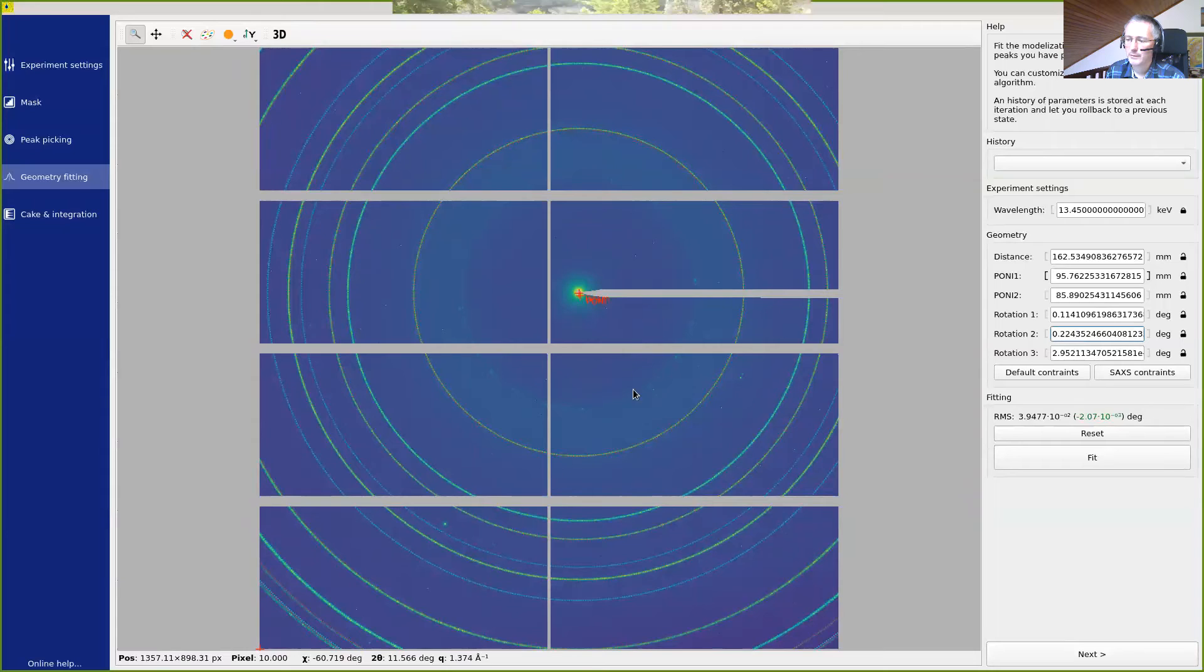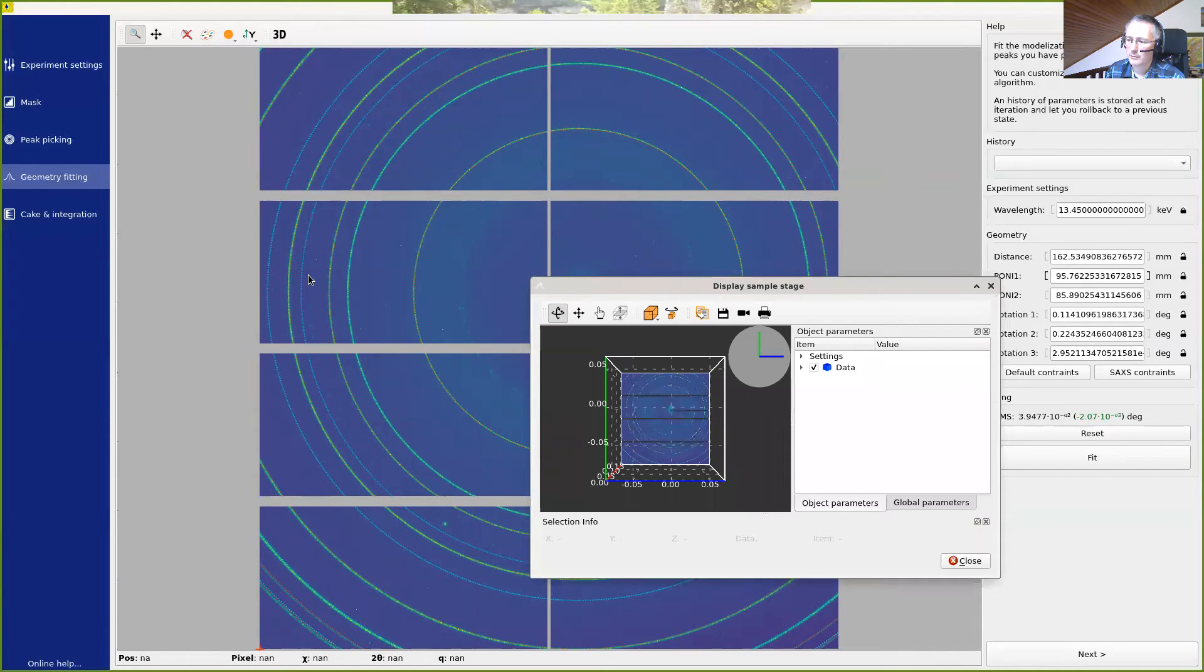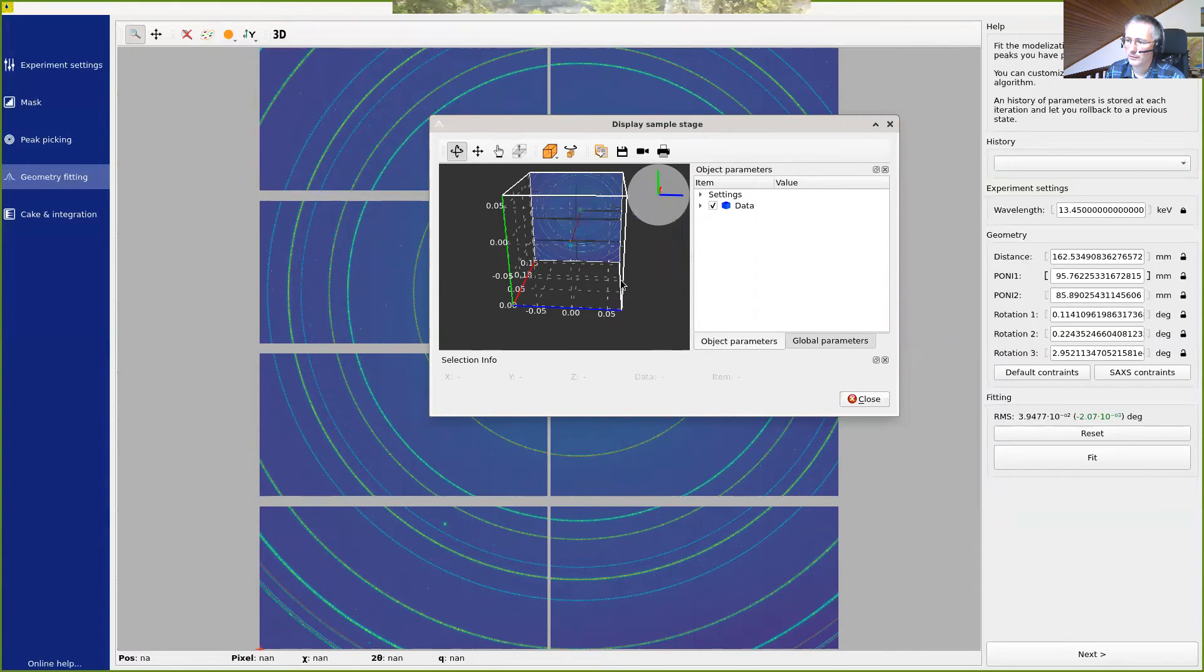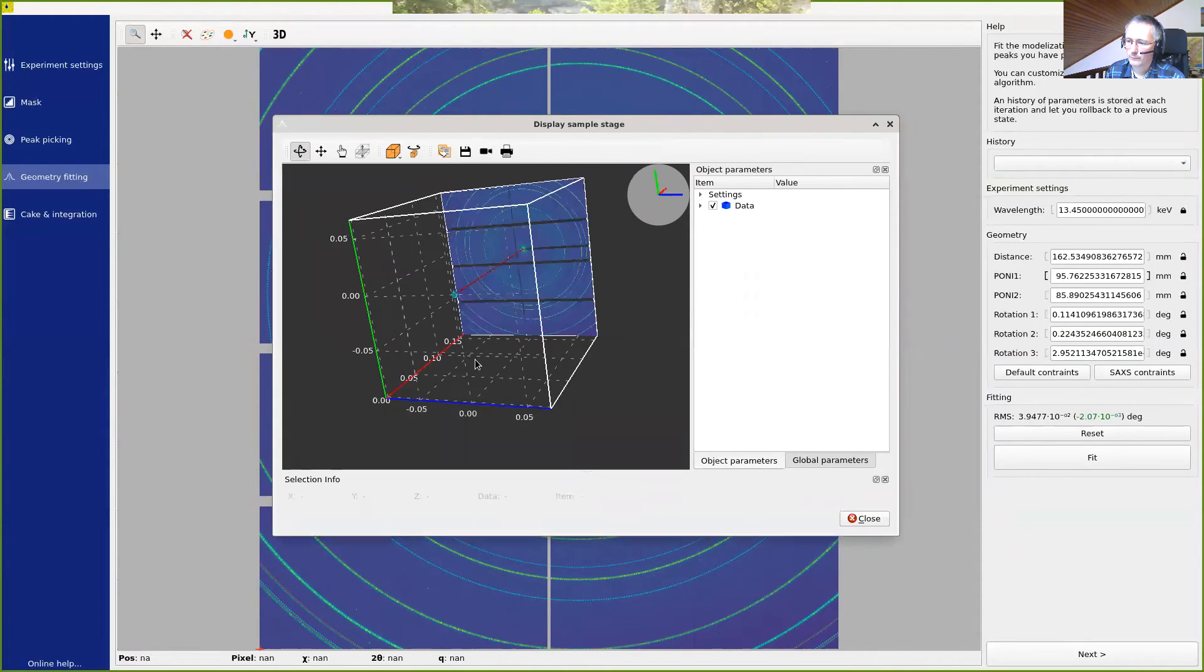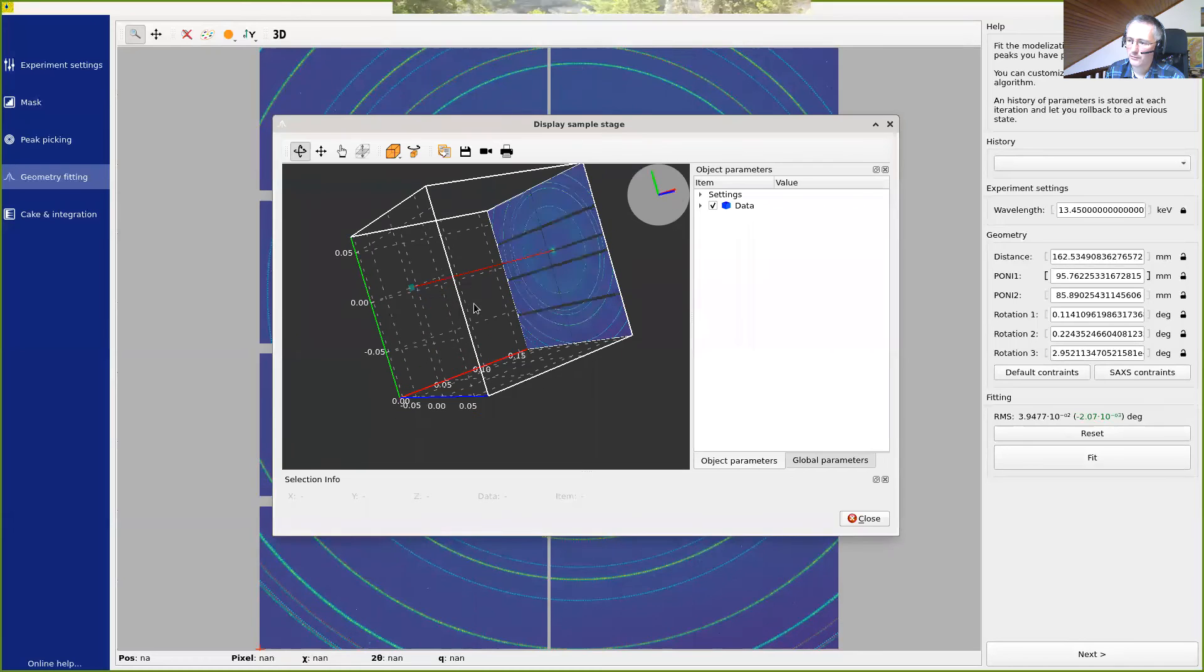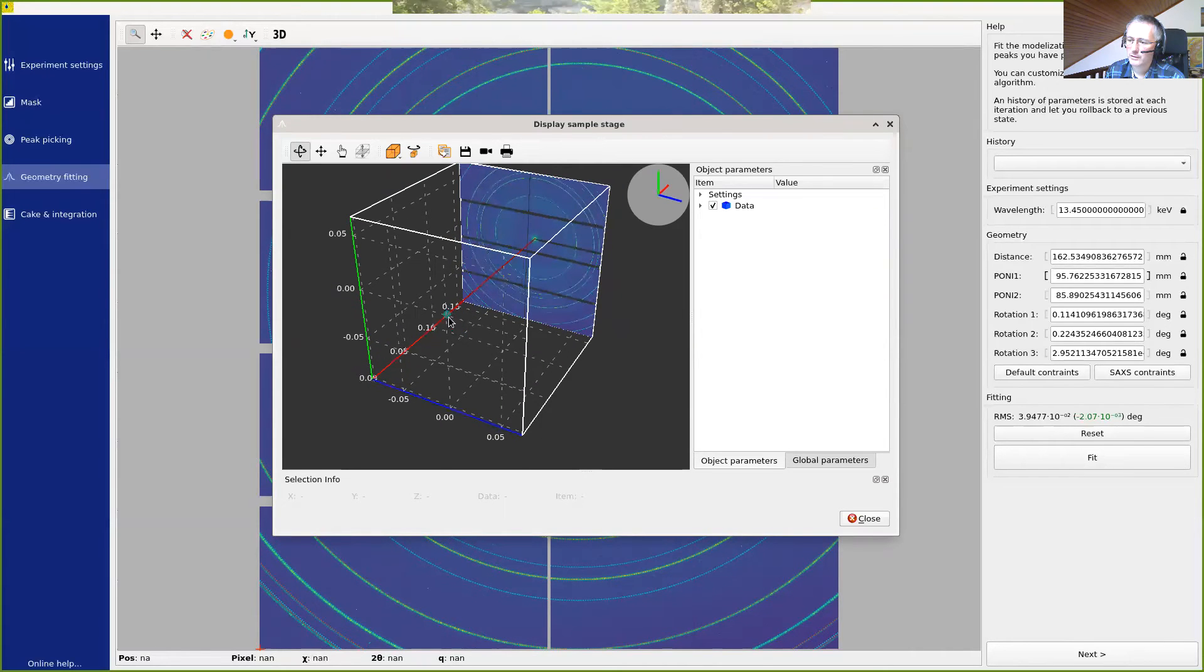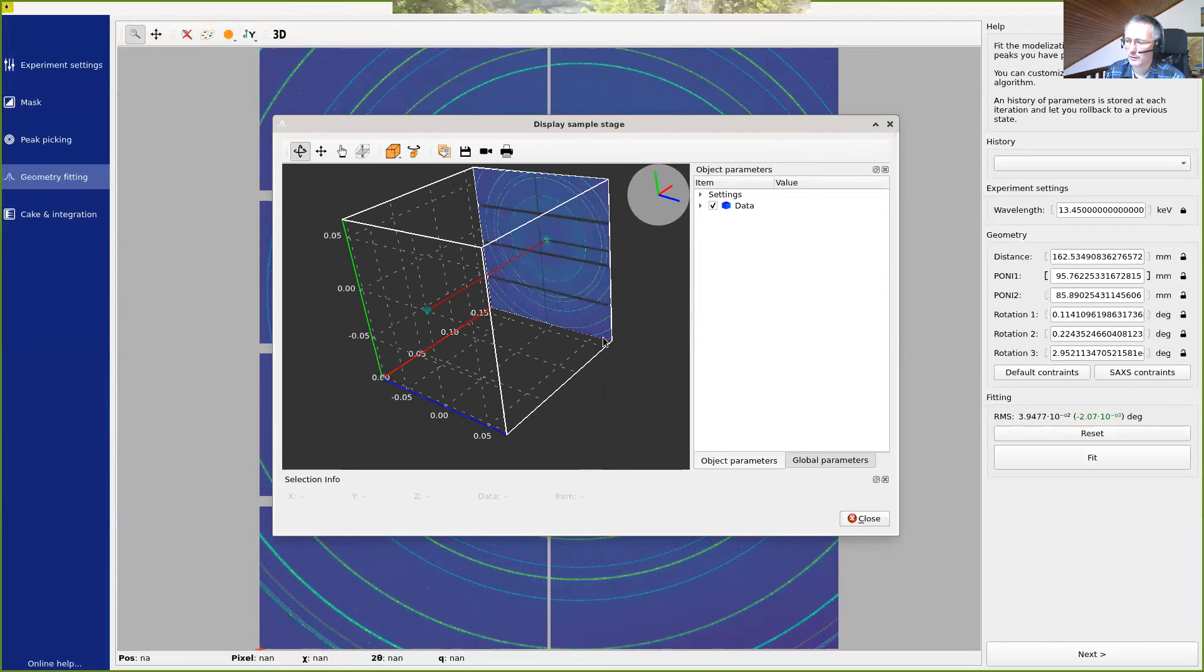And it can be interesting to visualize in 3D what the experiment looks like. This can be done using this 3D button like this. And if we move here, we can see here the sample, the incident beam, which goes to the beam stop. And we can see the different Debye Scherrer rings. So if you do not understand what is going on, this 3D visualization sometimes helps you to understand that your sample has been guessed behind the detector or completely sideways and may help you to understand what's going on.